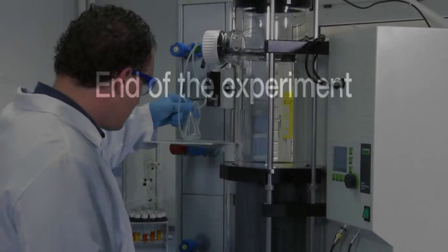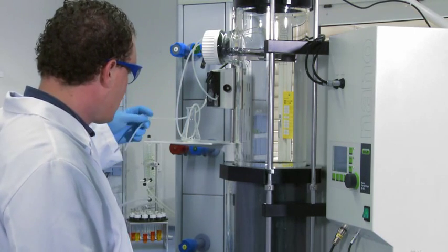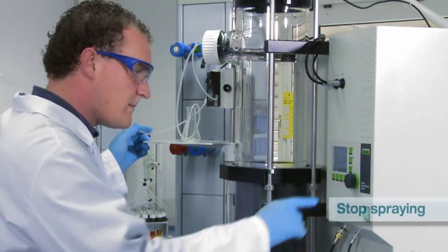The spray drying is now in process. Stop the experiment when the sample has been completely processed. Remove the inlet tube from the sample to empty out any residue from the tubing system.